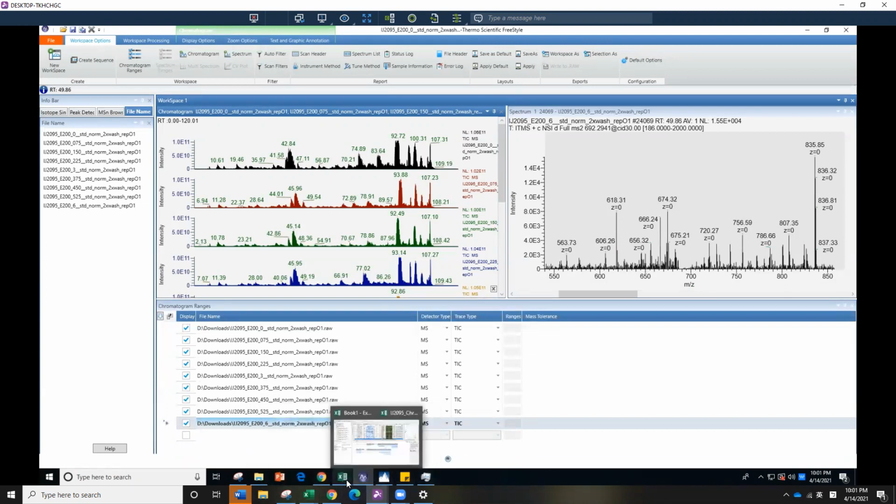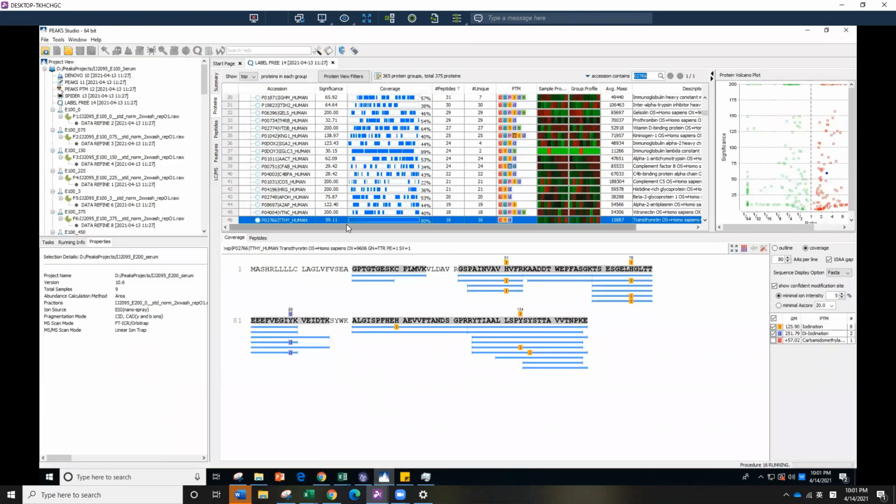The reason to do that is that these are TTR proteins. You can see we have the iodine on H51, H76, and Y134. For TTR, we want to compare different conditions, for 9 different runs. And sometimes we don't have the same site pass through the filters that the others have.